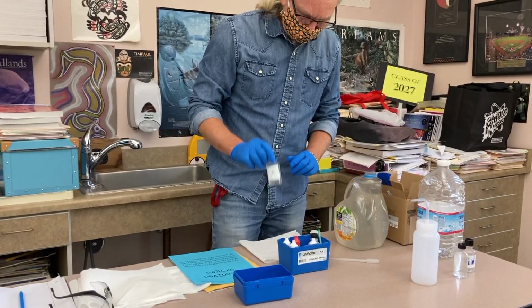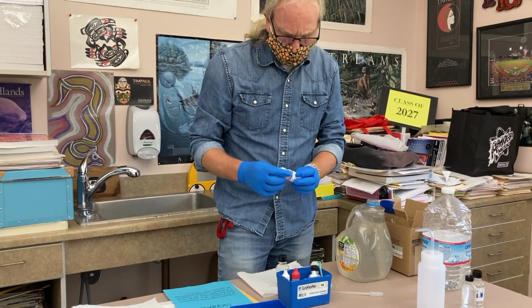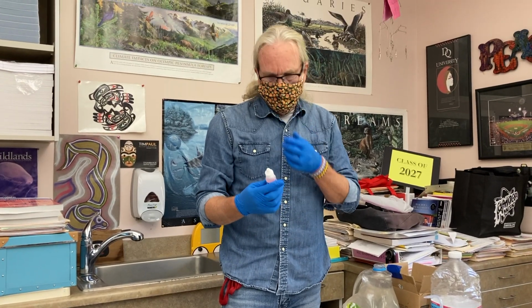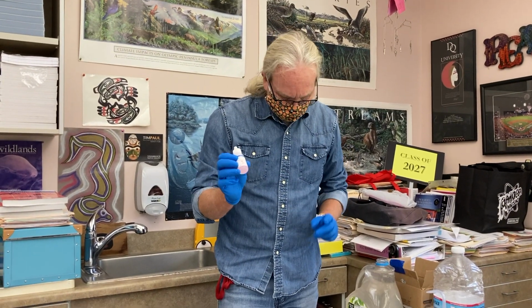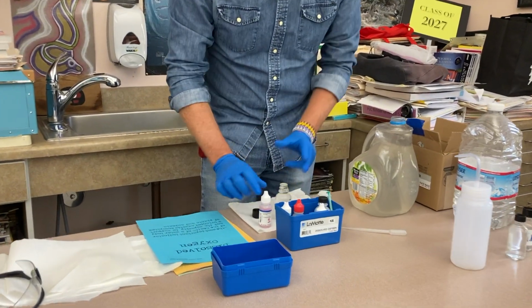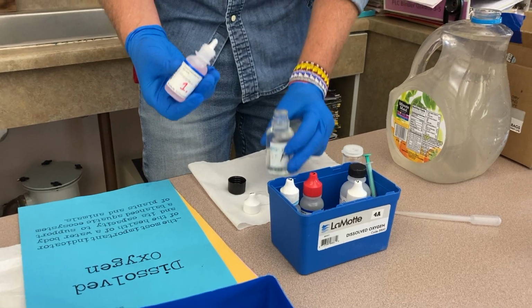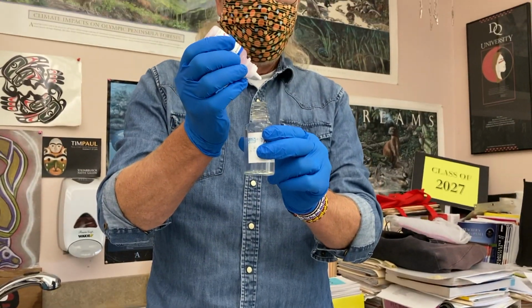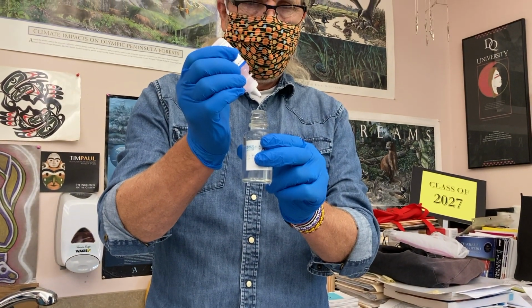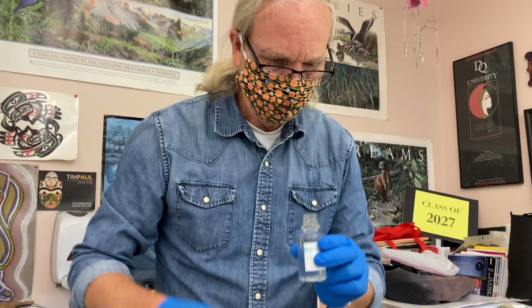So first off, we have some different chemical reagents we're going to put in. We're going to do 8 drops, starting with manganese sulfate. 8 drops. 1, 2, 3, 4, 5, 6, 7, 8. That's kind of fast. I should slow that down. Oops.